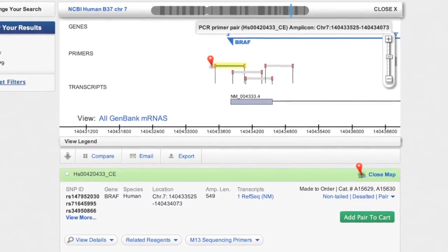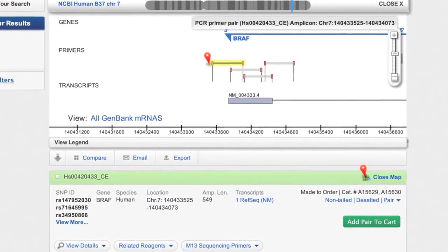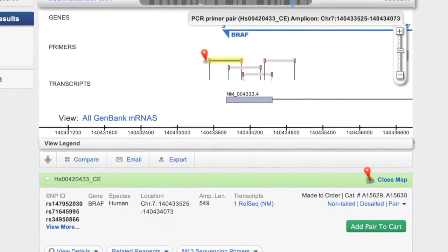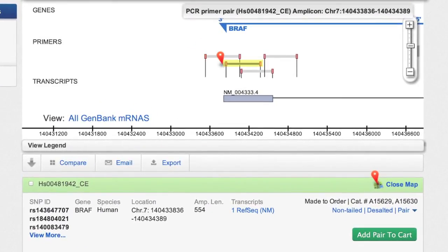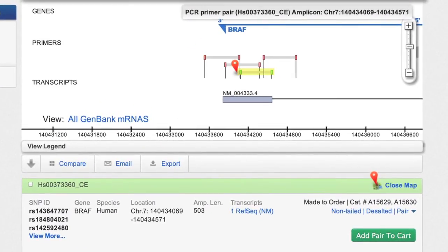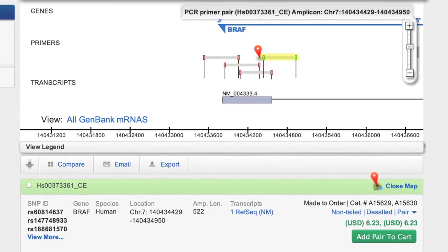The red pin here represents the primer pair just under the map. Clicking another primer pair moves the pin, and the corresponding primer pair will be displayed.